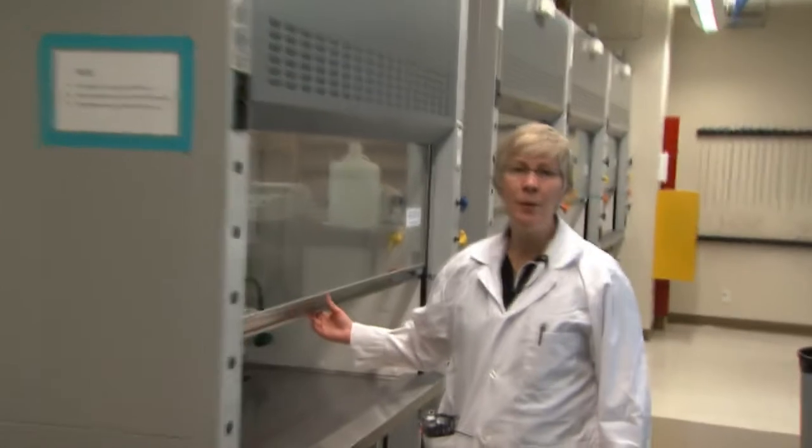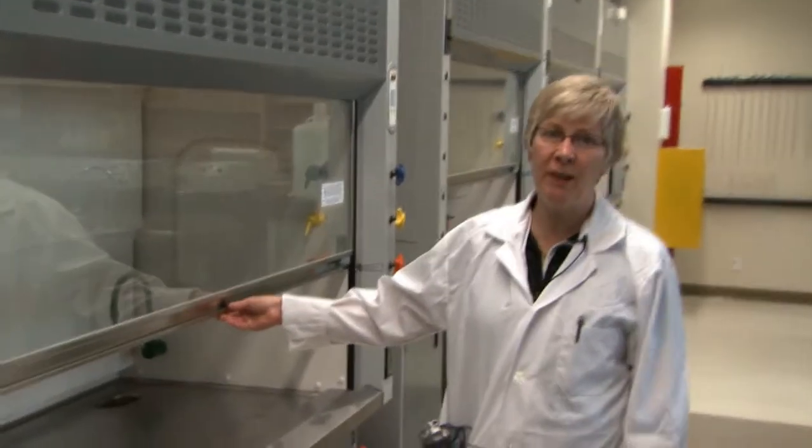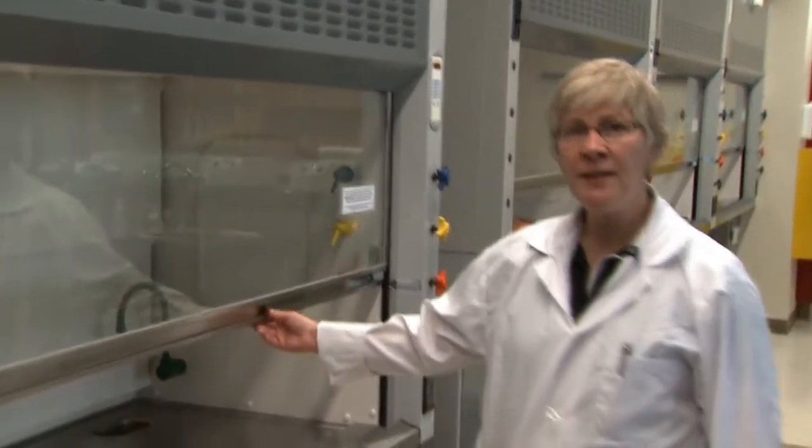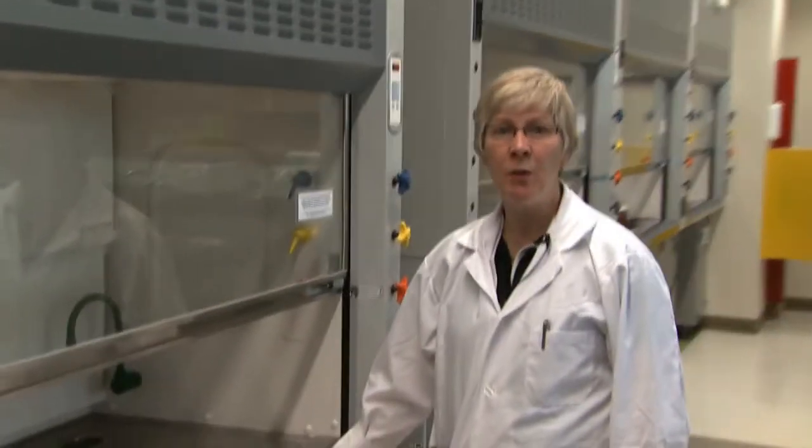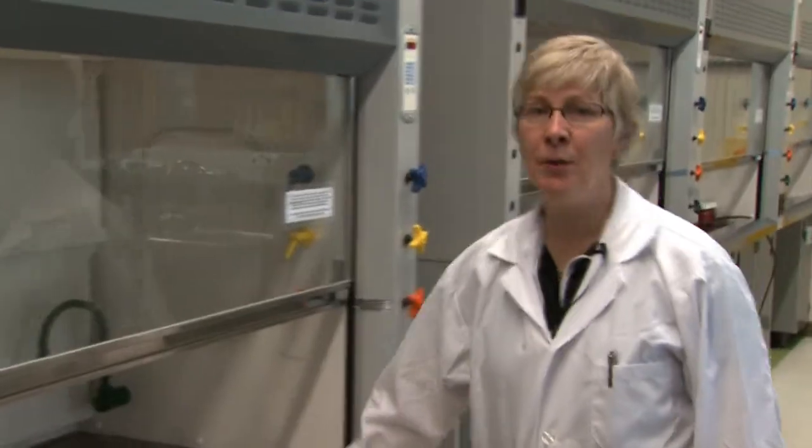We have state-of-the-art fume hoods, recently installed in the newly renovated Cousins Building. You'll notice that these are different types. This one is lower so that short persons or persons using wheelchairs have access to the fume hoods.